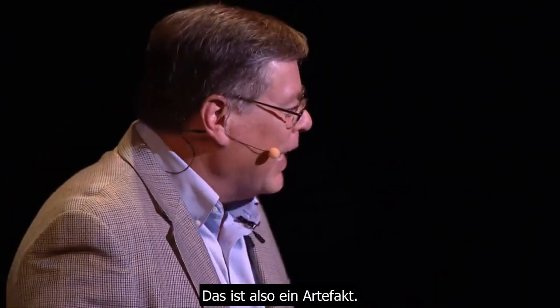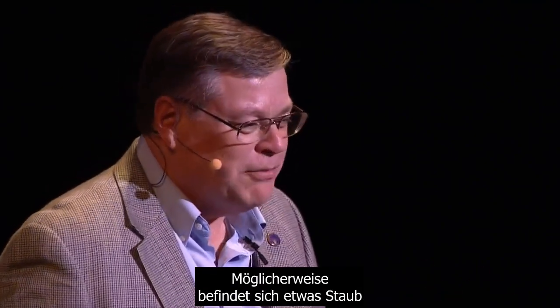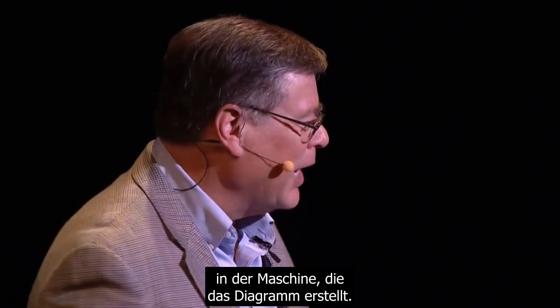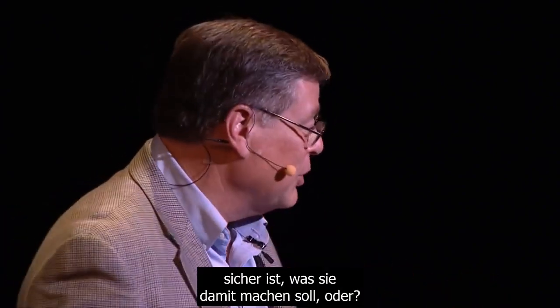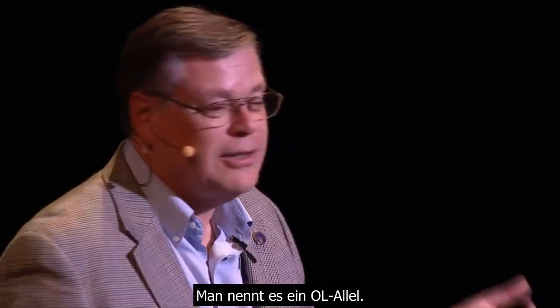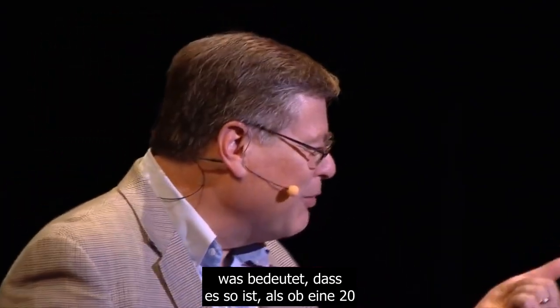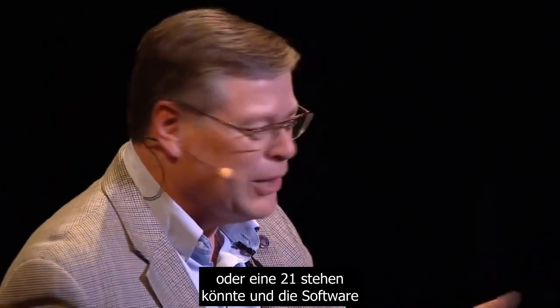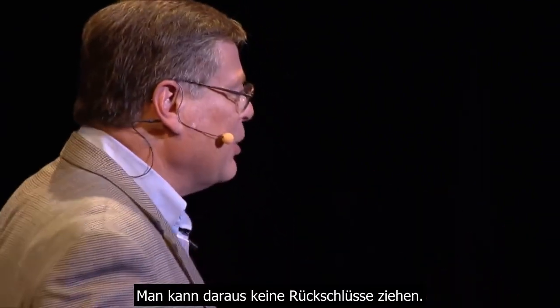So that's an artifact. It's not reproducible. Nobody knows what causes them. It could be a bit of dust in the machine that's generating the graph. It's not important. Even the software is not sure what to do with it, right? It can't put a number on it. It calls it an OL allele. That's short for off-ladder allele, meaning that it's sort of like where a 20 might be or a 21. The software doesn't even know what to do with it. You can't draw any conclusions from it.